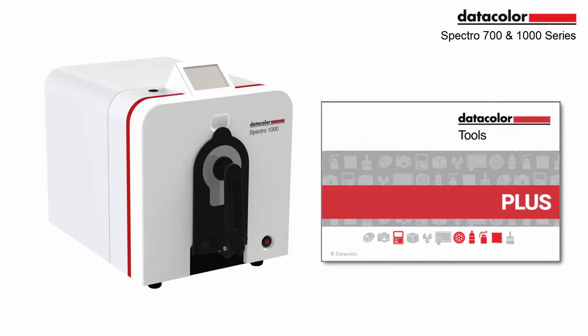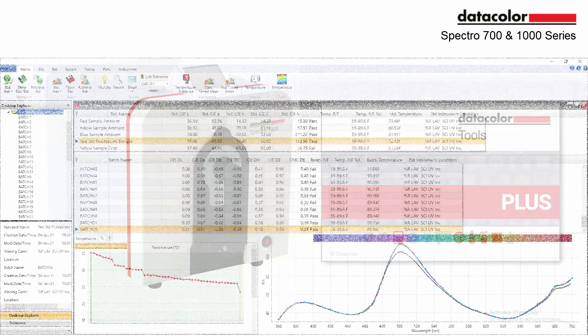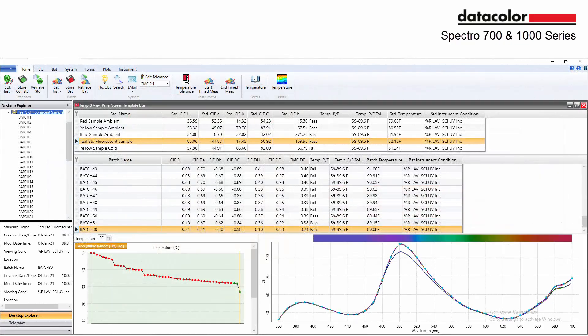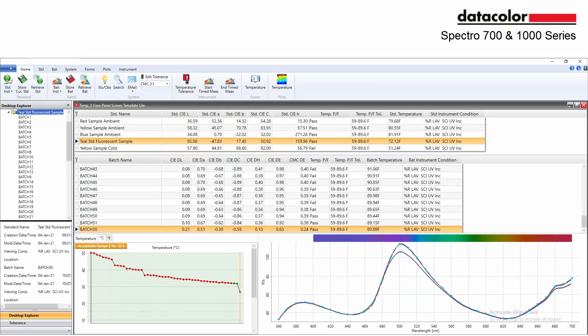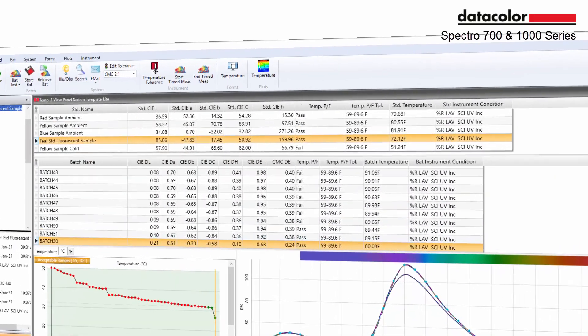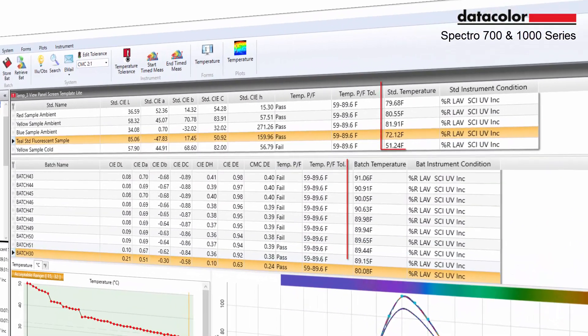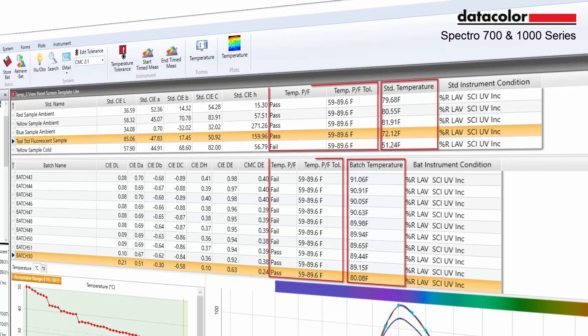The companion software Datacolor Tools offers a template and form that reports sample temperature for standards and batches, a minimum and maximum temperature range defined by the user, and a pass-fail determination.